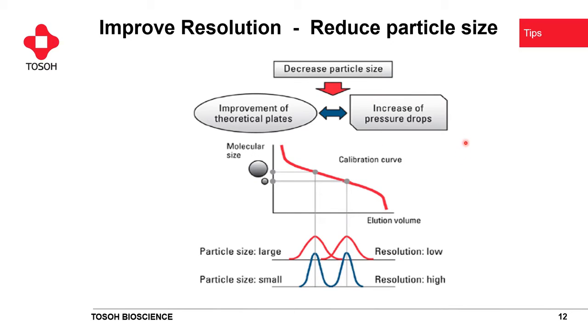However, what we need to take into account is that we have an increase in the pressure drop, and our instrument needs to be fit for that.